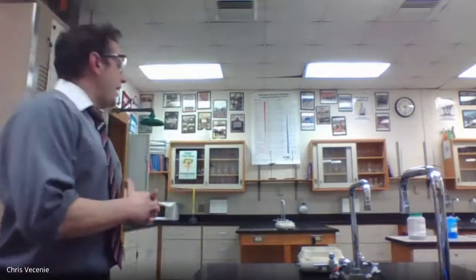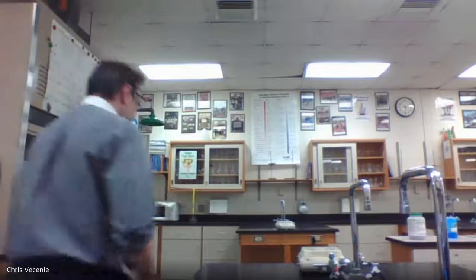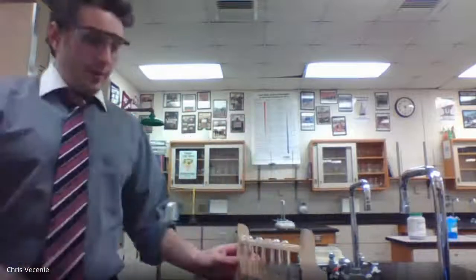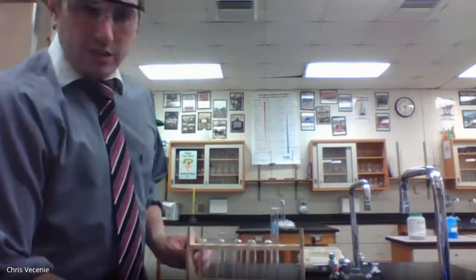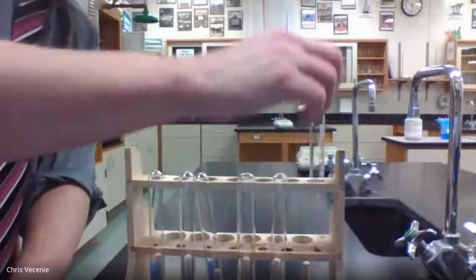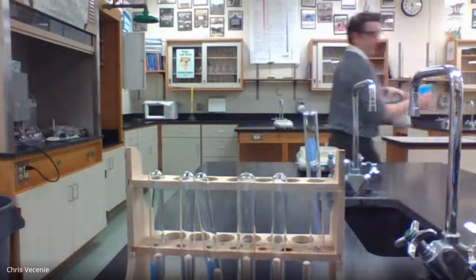Now in the first experiment, we're going to react zinc with copper II nitrate. To do that, we're going to use just our test tubes and the supplies from the middle counter. So I'm going to take out a test tube and put it in the top shelf, turning this so that you get a good look at what's going on in there. I'm going to go to the middle counter for the substances I need.